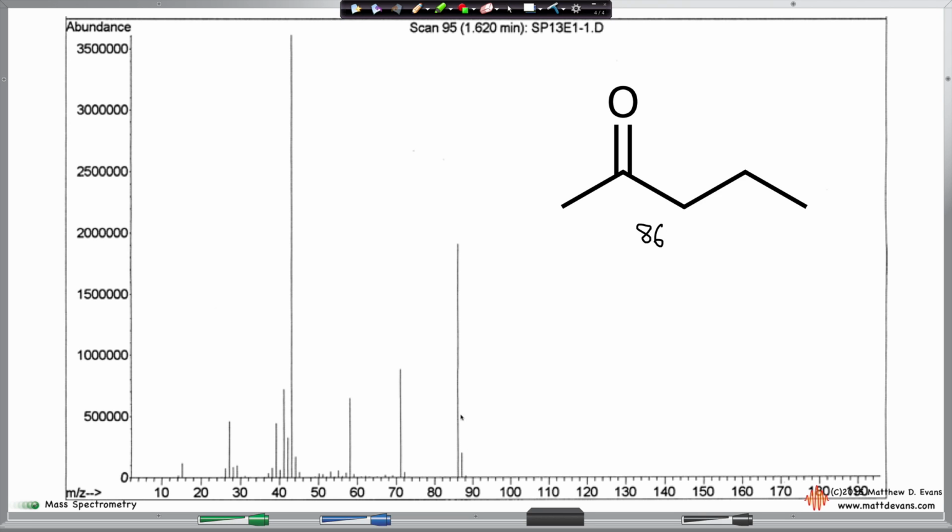So here's the parent peak, and I'm going to label this. The parent peak, again, is the rightmost peak. That's really the most interesting one because it gives us the formula mass of the compound, and that matches up perfectly. If this is 80, 82, 84, 86, here's that big peak right here, the parent peak. This one being the most abundant is, of course, the base peak. Off the top of my head, I can't tell you which fragment is producing that base peak, but it's some smaller version of this molecule producing the most stable carbocation. That's the base peak right here, and then a bunch of other peaks for other fragments.